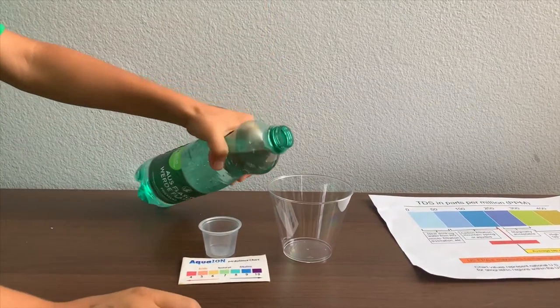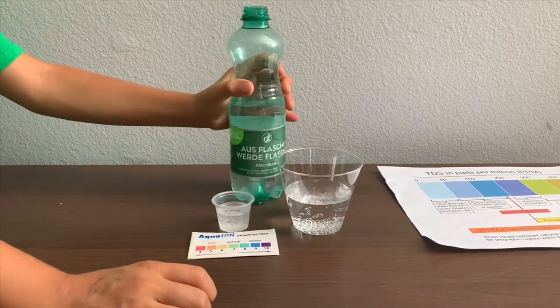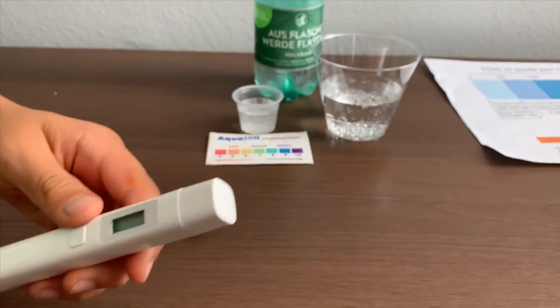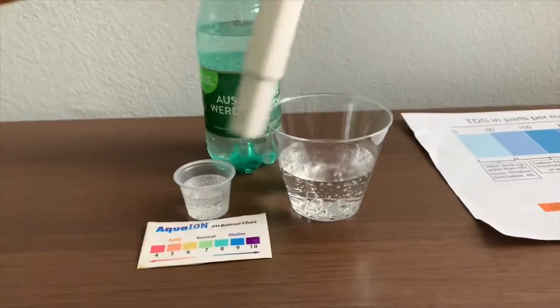Let's pour some water in. First, let's test the TDS levels. If you want to buy this TDS Tester, check the link down below. Turn on the TDS Tester, make sure it says 0, and put it in.